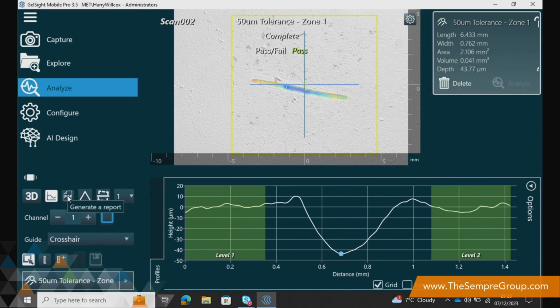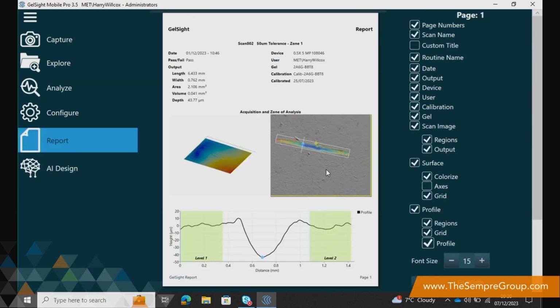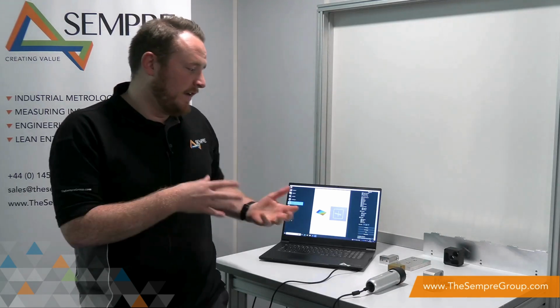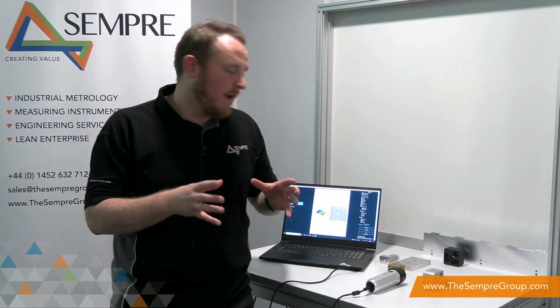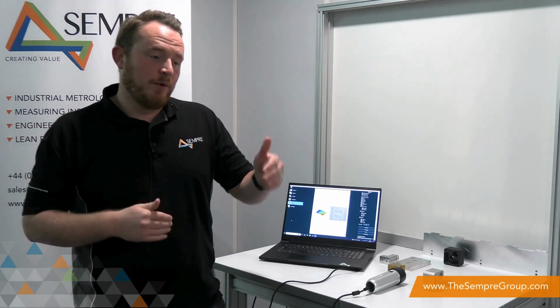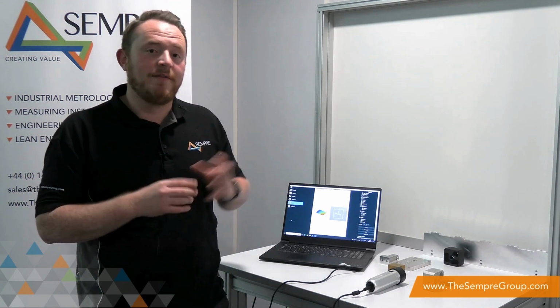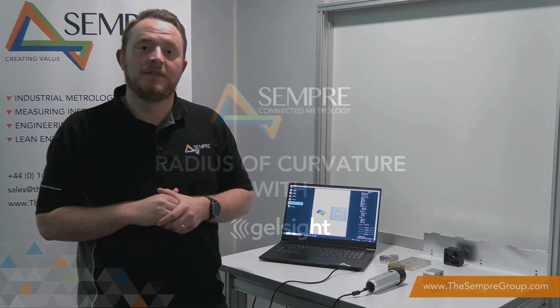Now as an operator or a user, I would just need to go to the PDF button, and there's a report of all of that information. I can save that onto a network or export it, print it out, stick it to a tracker sheet for the defective part. It's a really good example of how I've gone from there's a defect on my sample within a specific area that I need to tolerate or understand. Within 3 clicks, I've got a report of a traceable set of information that we can use to understand a little bit more about that defect.